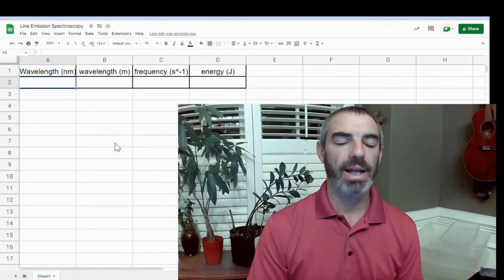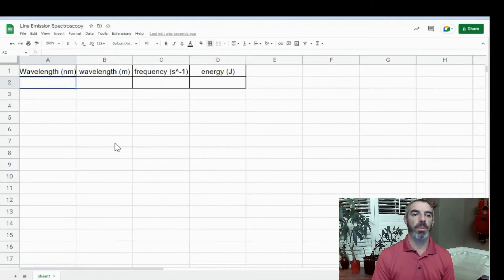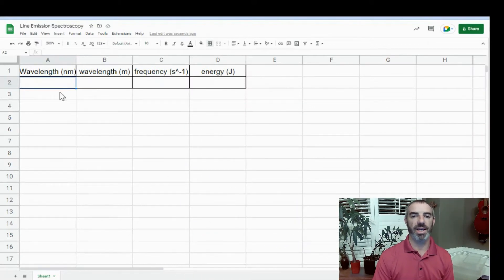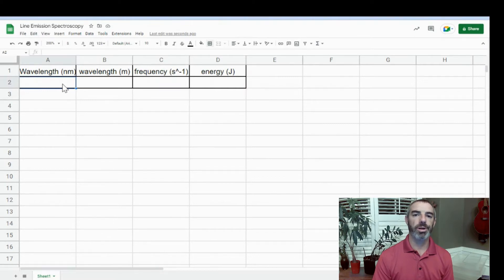I'm Mark Cavanaugh for CAVI Coaches with a CAVI Coaches Quick Tip. You've collected data for your line emission spectroscopy lab, and now it's time to analyze that data. The first thing we're going to do is type in our data.